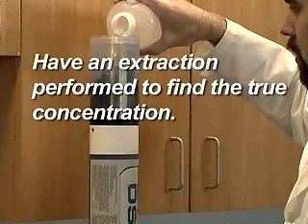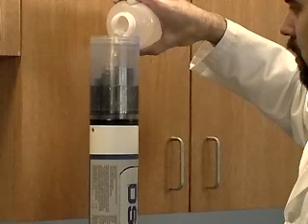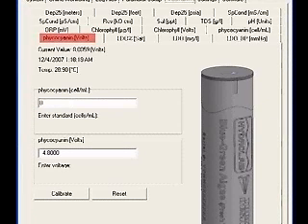Have an extraction performed on the sample to find the true concentration. When the results of the extraction are known, the sensor is recalibrated using this value. The secondary calibration will be done under the Phycocyanin volts tab or the Phycoerythrin volts tab.